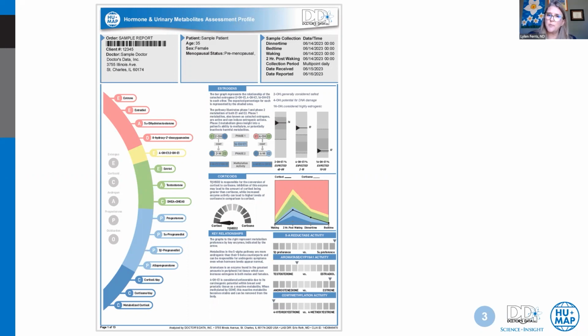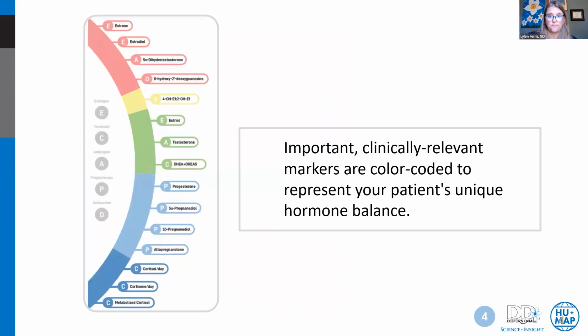We determined this based on what is most well researched, as well as speaking to providers who frequently utilize this testing and taking into account the information that they utilize the most. We know that providers tend to have very little time, and our aim was to give you as much information at a glance as possible in the first 2 pages of the report. We'll get to the second page momentarily, but let me start by walking you through the summary page section by section.